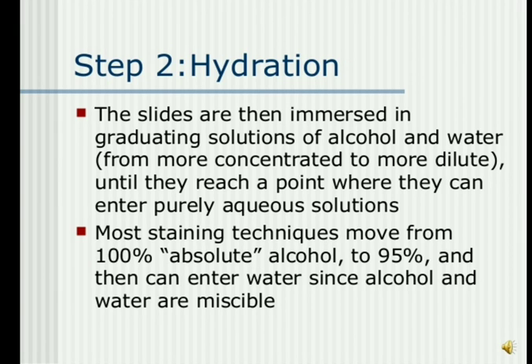Next step is hydration. The slides are then immersed in graduating solutions of alcohol and water, from more concentrated to more dilute. Most staining techniques move from 100% absolute alcohol to 95% and then can be entered in water, since alcohol and water are miscible.